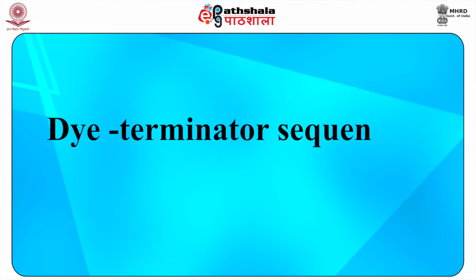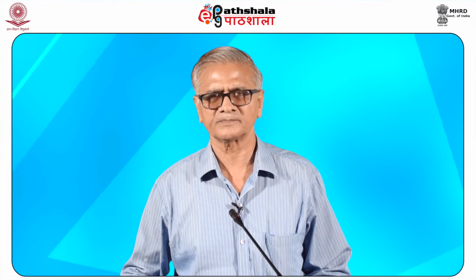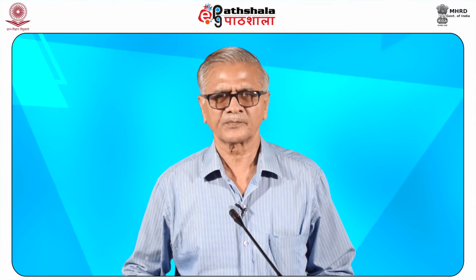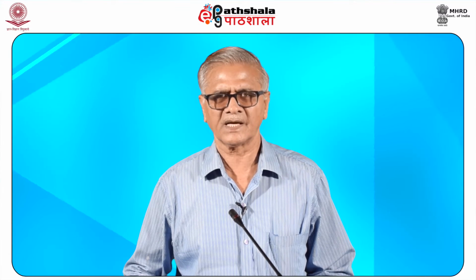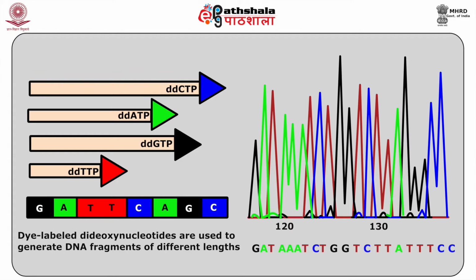Next method is dye-terminator sequencing. Dye-terminator sequencing utilizes labeling of the chain terminator dideoxynucleotides, which permits sequencing in a single reaction rather than using 4 reactions as in the labeled primer method. In dye-terminator sequencing, each of the 4 dideoxynucleotide chain terminators is labeled with fluorescent dyes, each with a different wavelength of fluorescence and emission.